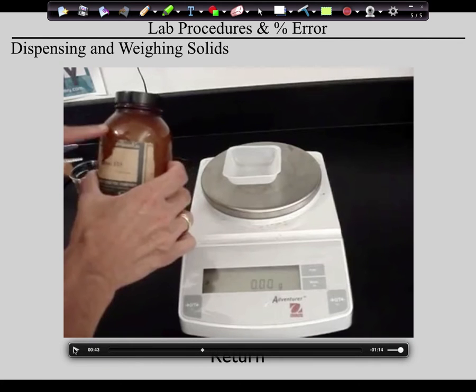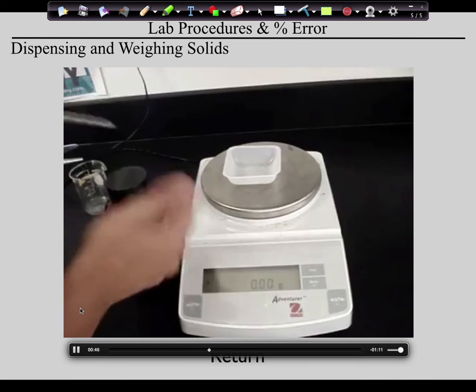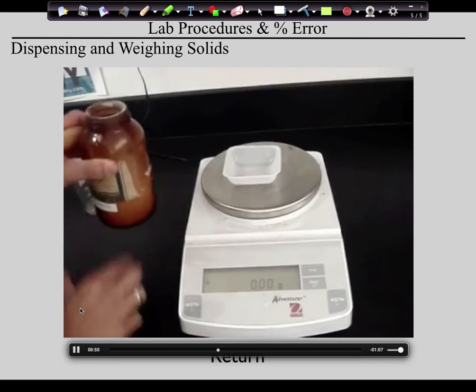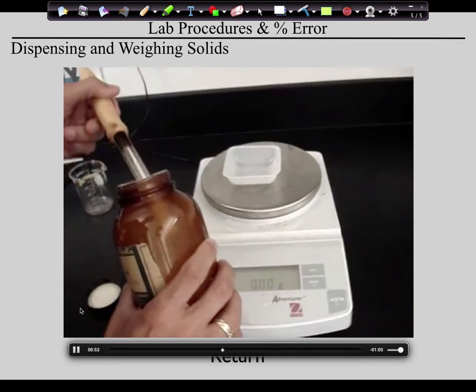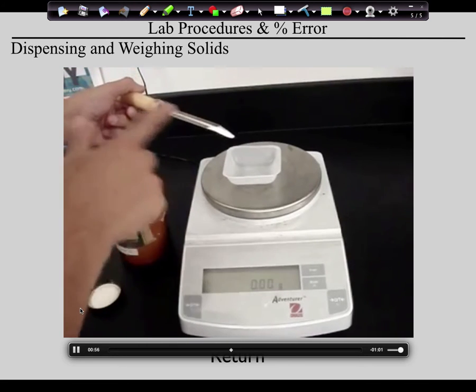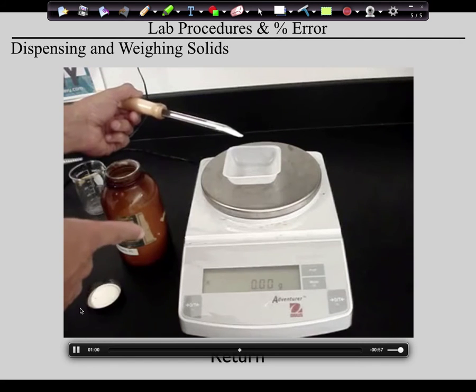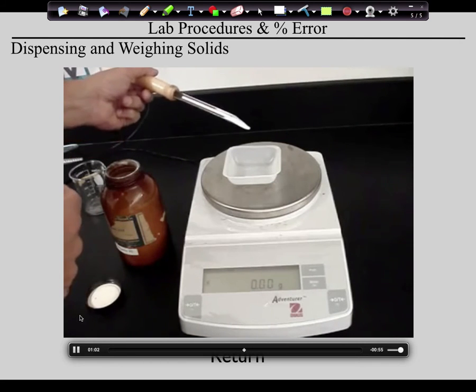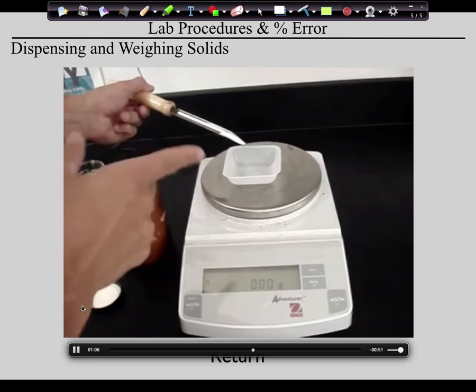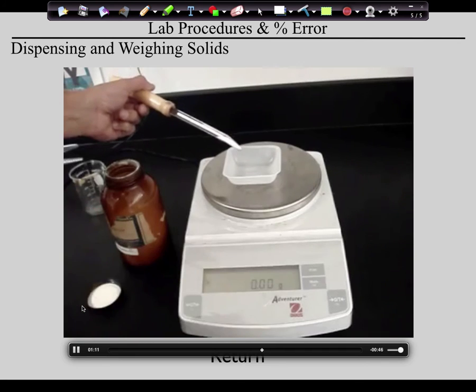So how do you avoid it? Check it out. So what we want to try to do is to ease up to that 2 grams without going over. So I use my spatula to put a certain amount in. Now, I might not know how much of this looks like 2 grams. So if I just dump this whole thing in, I might go over. And if I just dump it this way, I don't have very good control of how well it flows into the dish. It might go nothing, nothing, and then all at once.